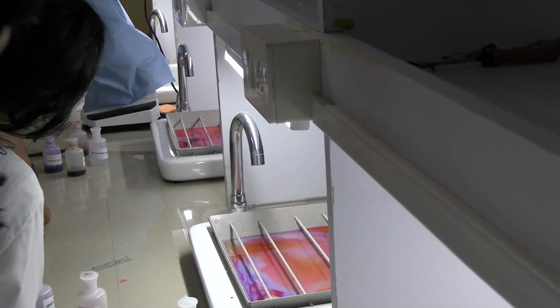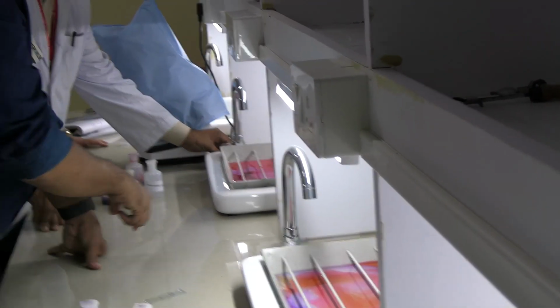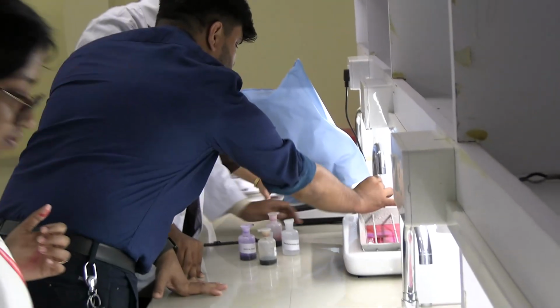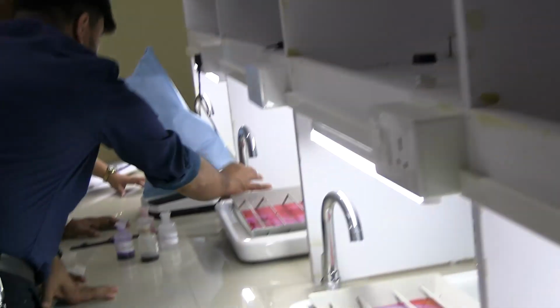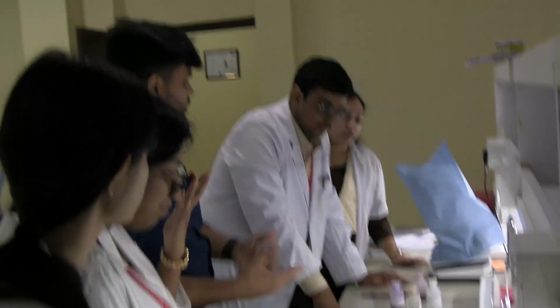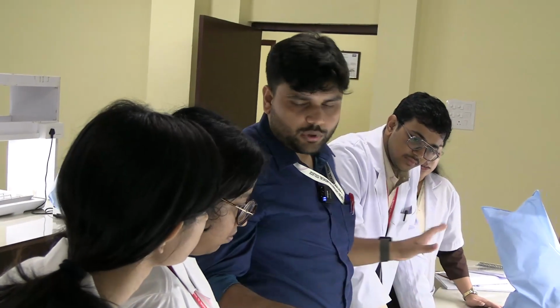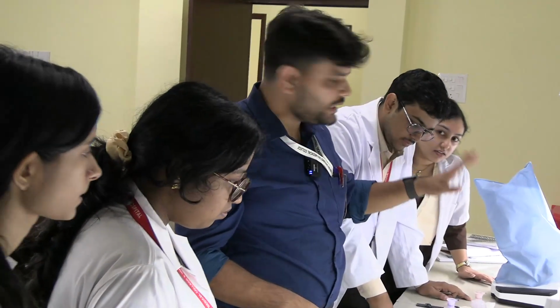Why are you holding it like this? Is this the way to hold it? No. You hold it on the top, so you can put it there. You can hold it on the top like this and put it here. Done. So you're gonna wait for the excess water to dribble down, and then after that you can do the air drying, okay? So we're gonna let it dry a little bit.